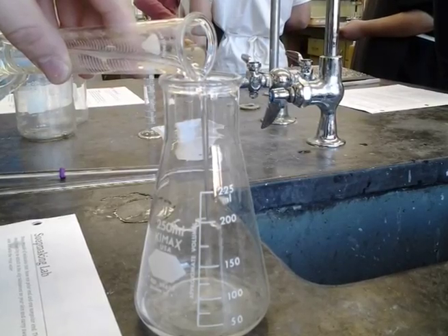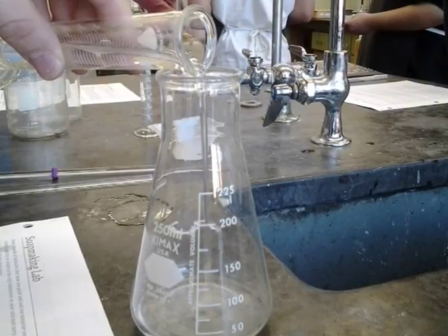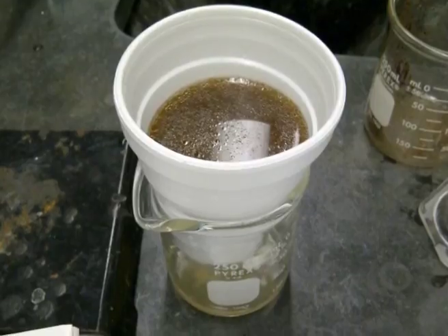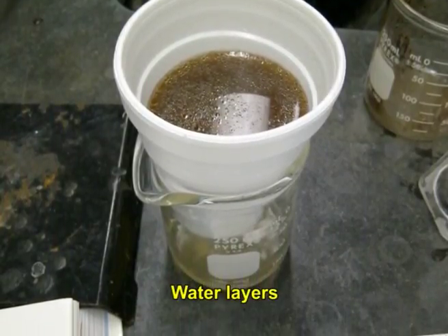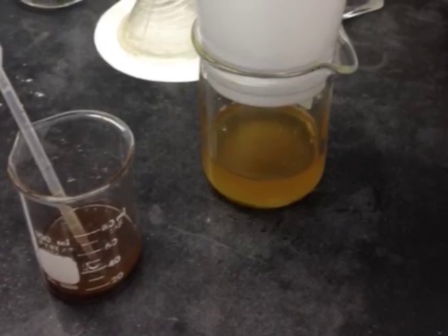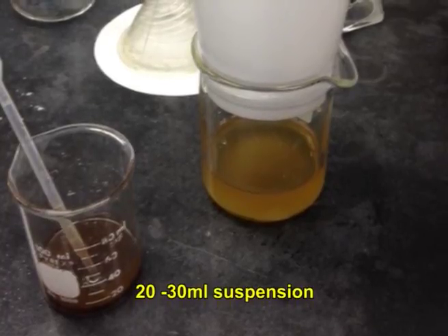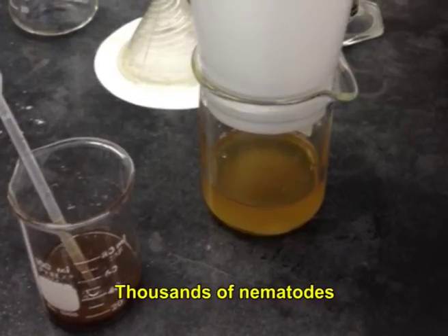Alternatively, the extract water is poured into a sufficiently large beaker and the nematodes are allowed to settle. Later, the topmost water layers are discarded and the remaining water is taken in a small beaker. This process is repeated until only 20 to 30 ml of suspension is left, which now has thousands of nematodes ready for further processing.